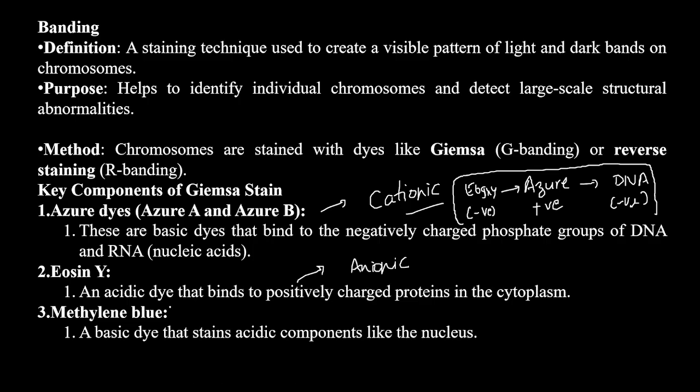Then you are talking about the methylene blue dye. Because it is again a positively charged dye, it will try to bind to the DNA, so there will be competition between the azure dye and the methylene blue dye.